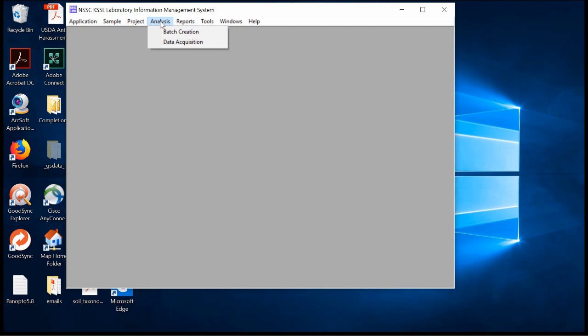The analysis command is after a project has been given an analysis schema or scheme, then as I said before, the technicians get the idea that they need to prepare these samples for analysis. And then once the preparations have been prepared and made available, then the technicians will get a list of, kind of like a to-do list.